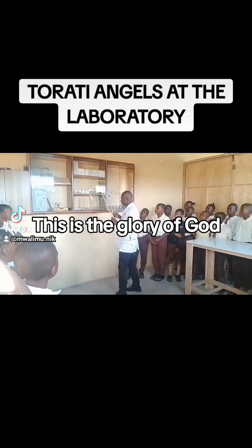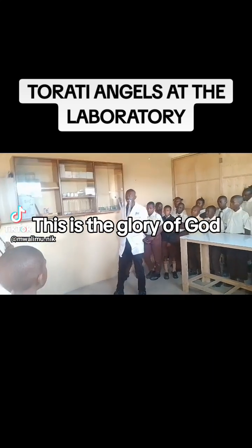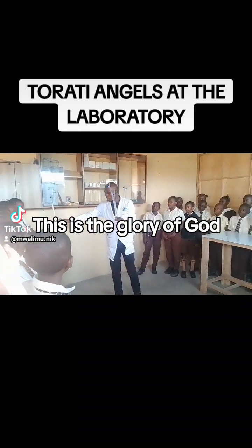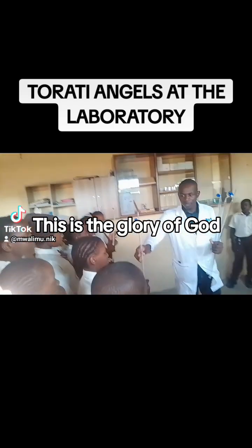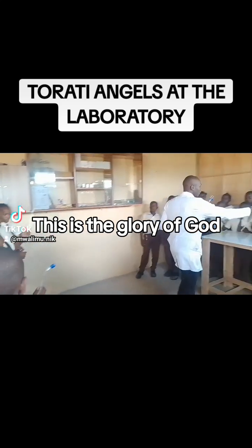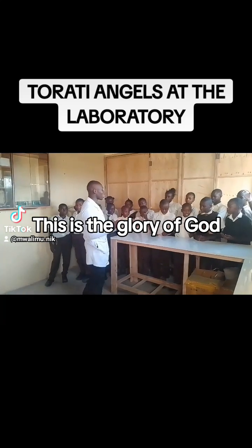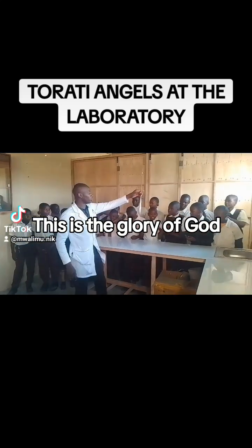So the first instrument that is used to measure volume is the burette. You can have a look. Yes, this side. You handle it carefully. Once you have observed, you give it to another person.